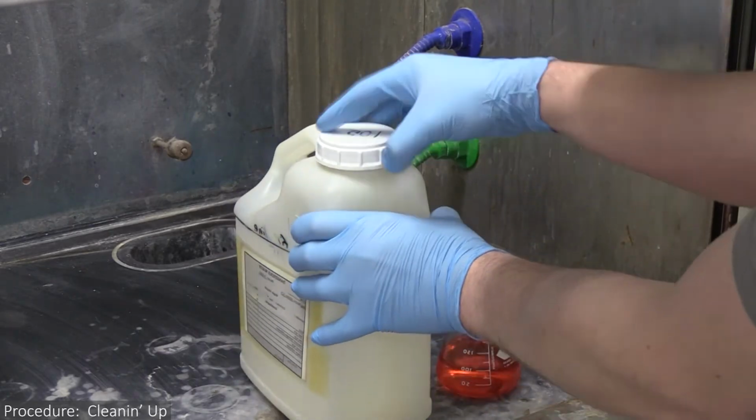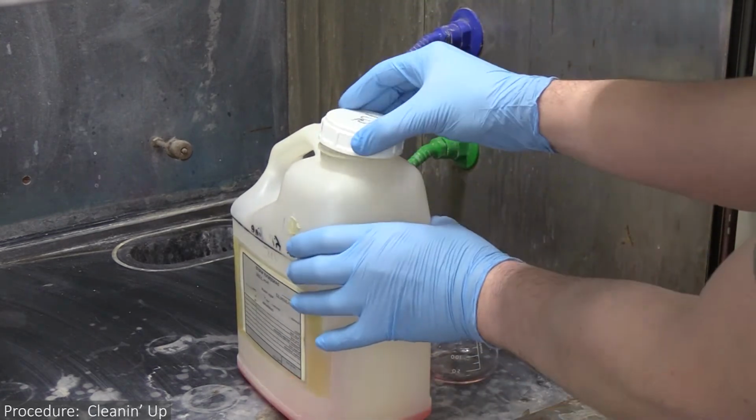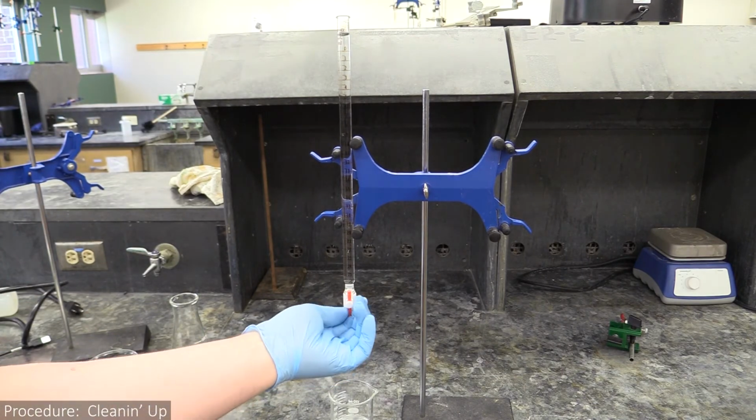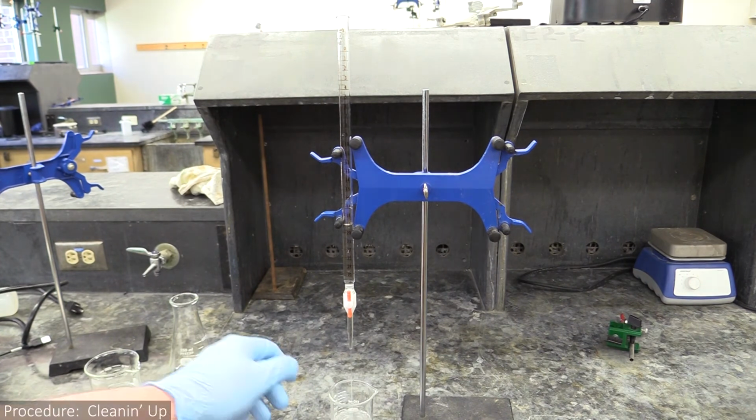And that's it for your data collection. When you're done, make sure to dispose of all solutions in the lab room's waste container. Also make sure you've drained all solutions out of your burettes and thoroughly rinsed them with DI water. When you're done rinsing your burettes, leave them with their valves open.